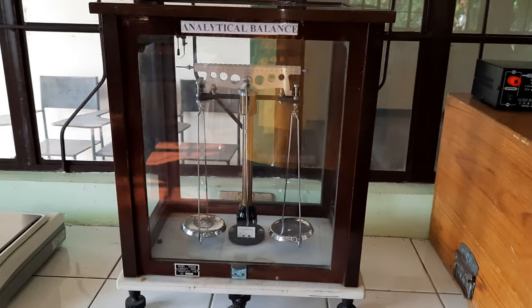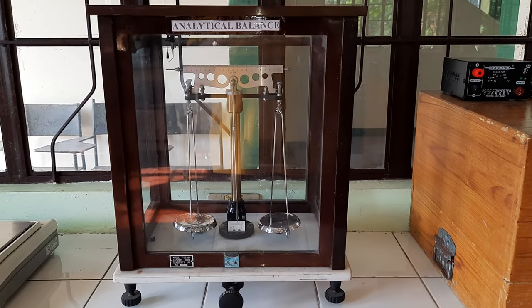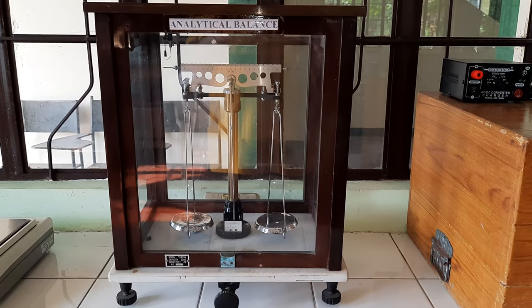We also have our classic, old-days designed analytical balance for measuring minute quantities in chemistry.